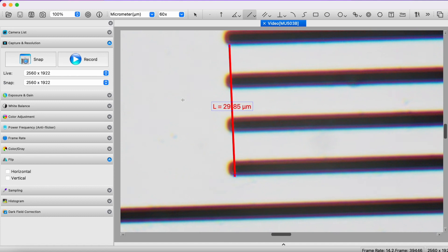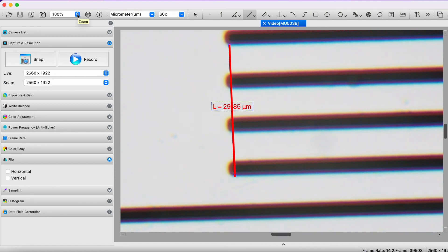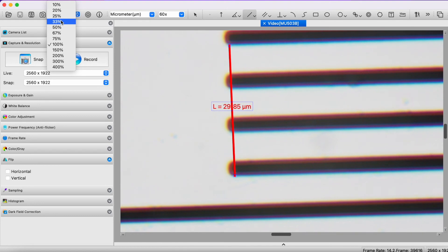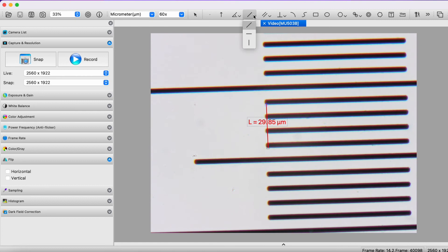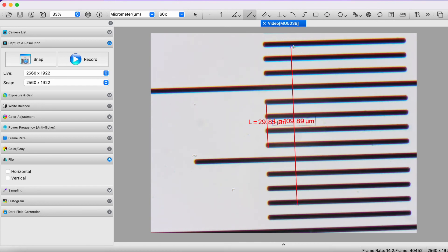The next question is: what if I have an object that is really too large for 100% digital zoom and I want to zoom out? You can certainly do that using the digital zoom. Now I'm at 33%. I'll go to the line tool and draw a line from here down to here. This tells me this line is 109.89 microns. We count eleven demarcations, so indeed this should be 110 microns long. It looks like the software is working out well.